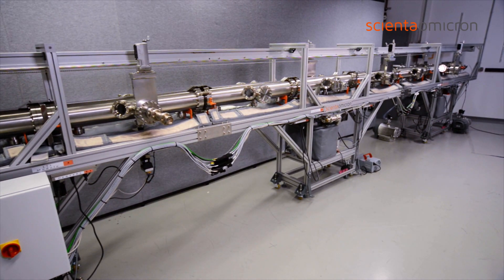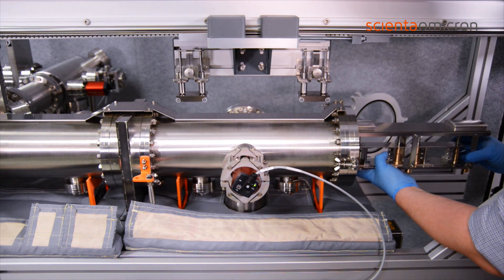The newly designed transfer line removes length restrictions, providing for cost effective, high quality expandability.